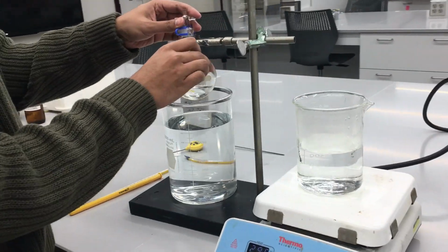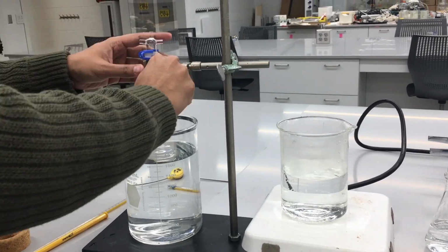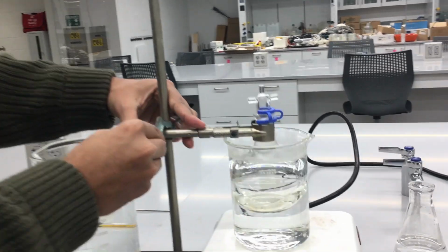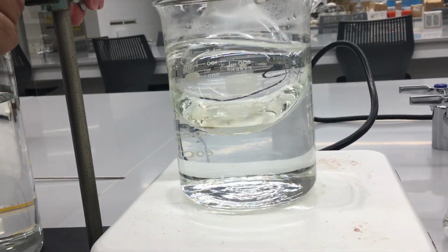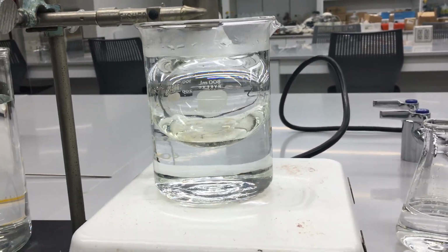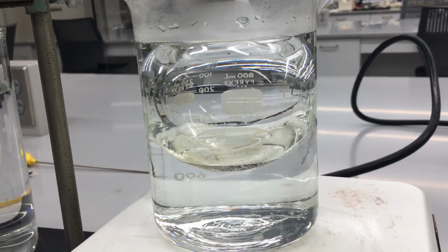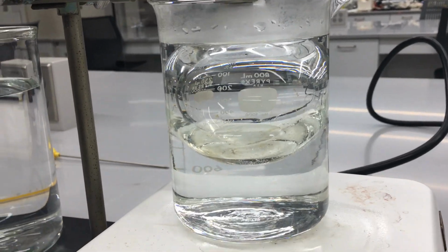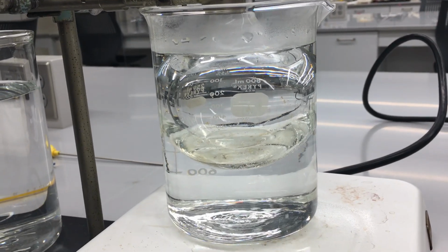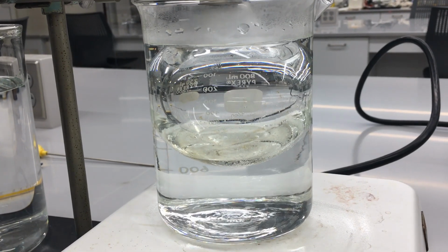Go ahead and clamp and cap that, and then stick that back into our water bath, our boiling water bath. And now we will wait until this volatile liquid becomes a volatile gas. So we can watch that small pool of liquid at the bottom of the round bottom flask disappear, showing that it's become a gas.